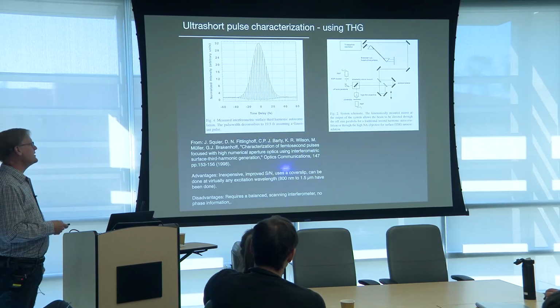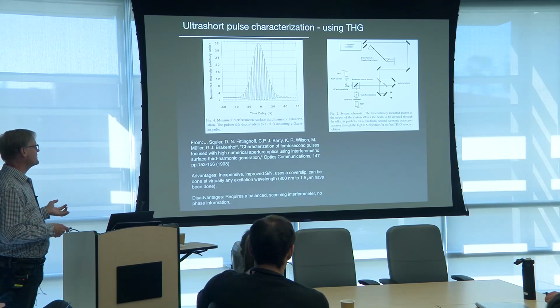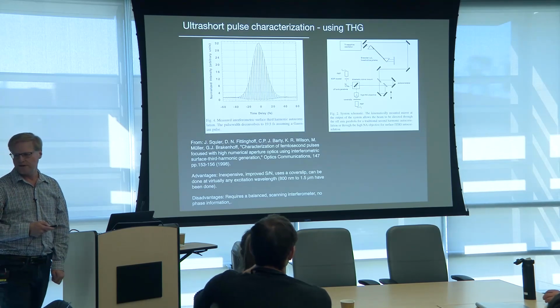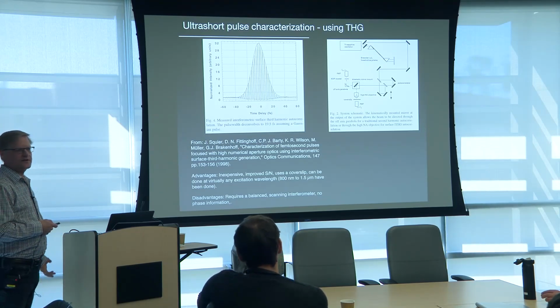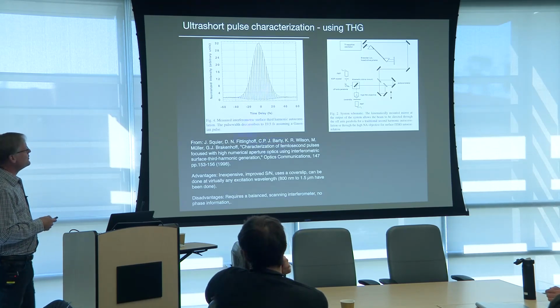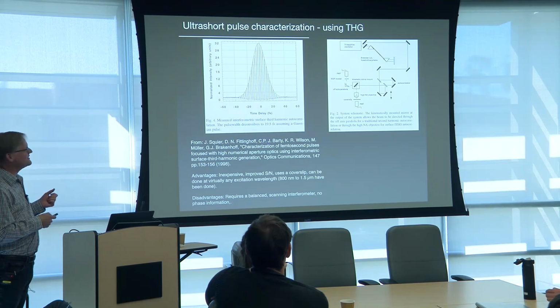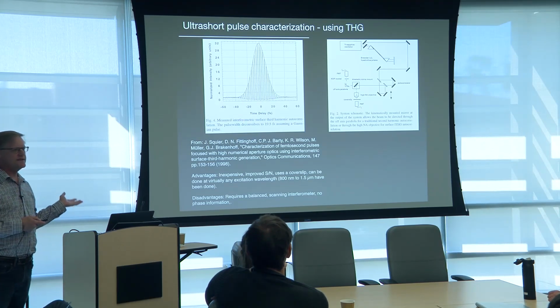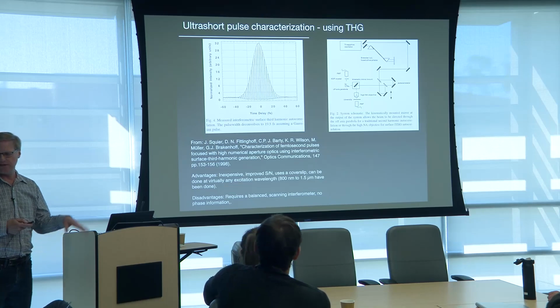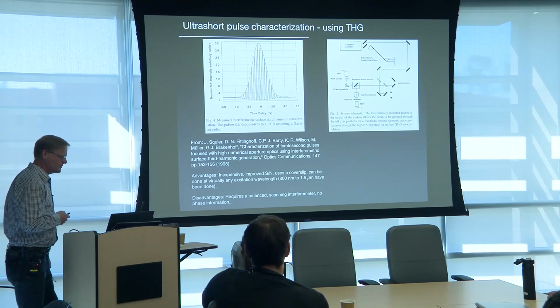And so I really like this one too, in that we've done it from 800 nanometer excitation wavelengths to 1.5 microns. So again, real easy to do. And the other nice thing about this is that you can see how clean it is. The wavelength separation between your excitation wavelength and where you're detecting is so big, it gives you super clean stuff.